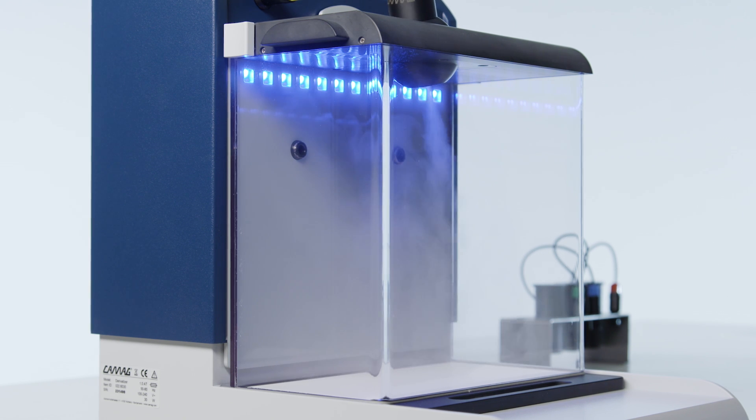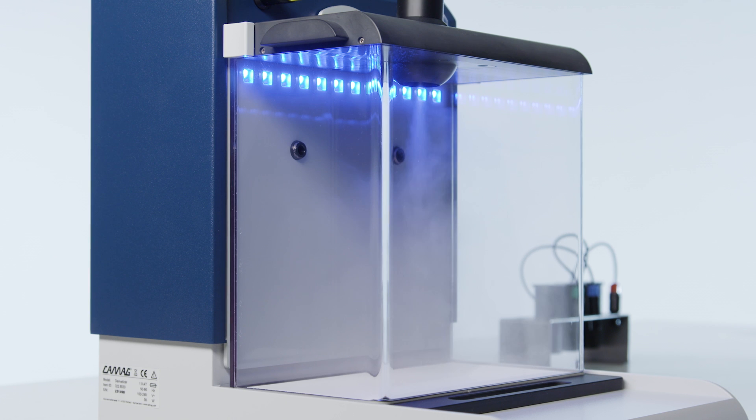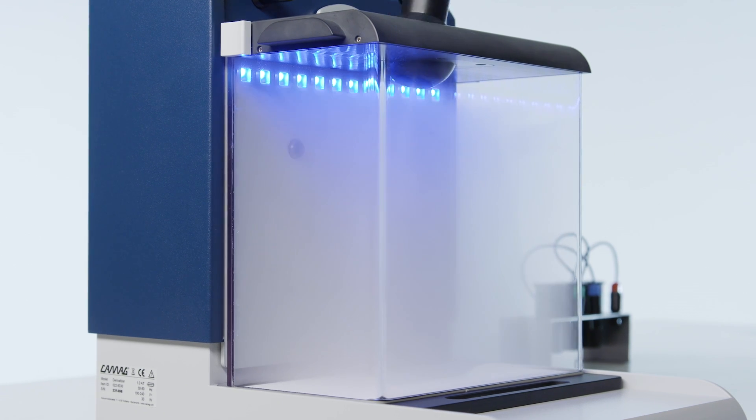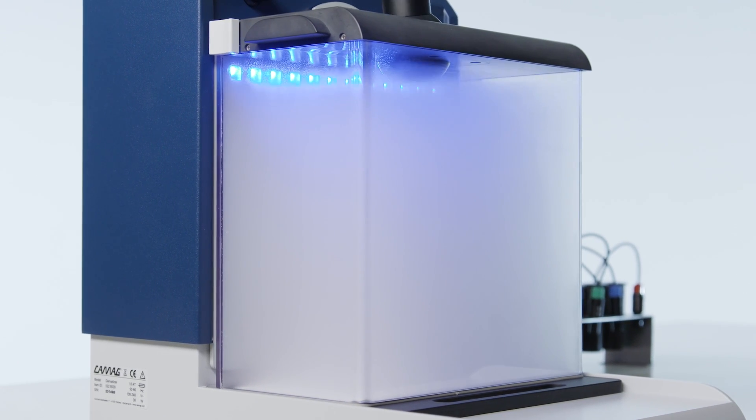The nozzle generates an extremely fine reagent mist which evenly distributes in the hood and gradually condenses on the plate.